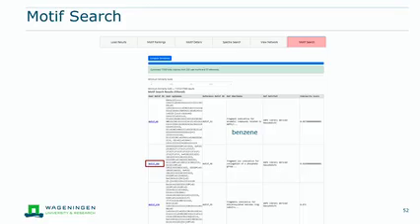And then you would see again a long table, with a similarity score between the master motifs generated automatically and manually. And you see, for example, the first one has a similarity score of 98, the second one 93, and they have an annotation which was in the earlier way always in a descriptive manner. So it would say this fragment indicates a methylbenzene, or for the second one, this fragment indicates conjugation of a phosphate group. In the new version, again, it's now SMILES. You can still add them manually if you want. But have a look. So the second one says it's a phosphate group.